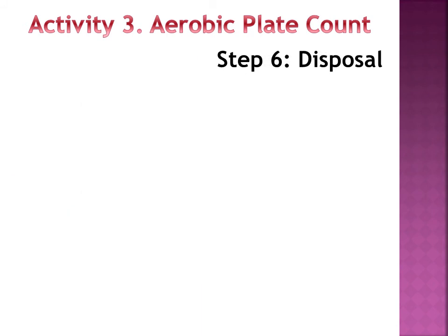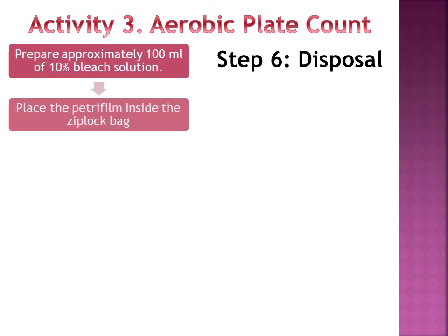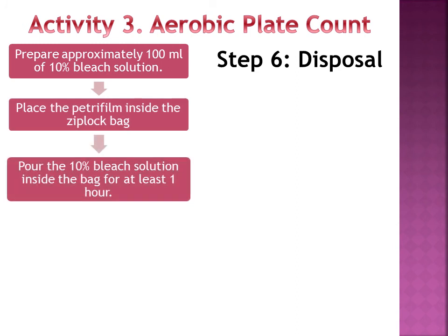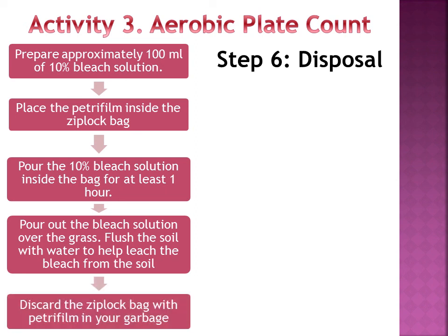If you are done, properly dispose of the petrifilm. Prepare approximately 100 ml of 10% bleach solution. Place the petrifilm inside a ziplock bag. Pour the 10% bleach solution inside the bag for at least 1 hour. Pour out the bleach solution over the grass, then flush the soil with water to help dilute the bleach from the soil, especially if you later want to grow plants or grass on or near the same area. Discard the ziplock bag with petrifilm in your garbage.